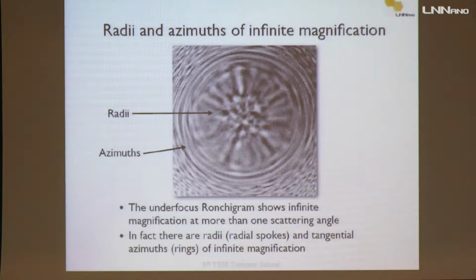When you go from the center of the Ronchigram to the border, we see the deformation of the image, radial at first, and azimuthal deformations toward the border of this object. These deformations in the image are all related to aberrations of the lenses of the microscope.